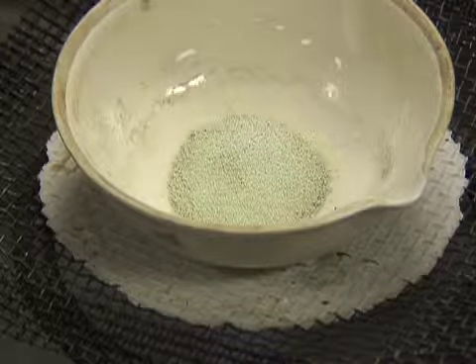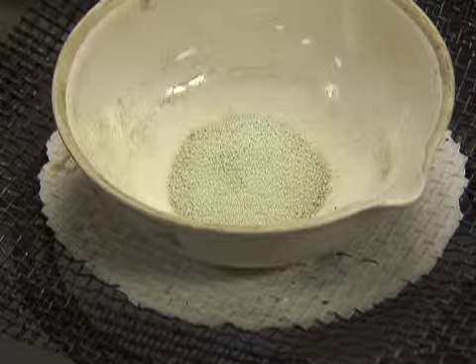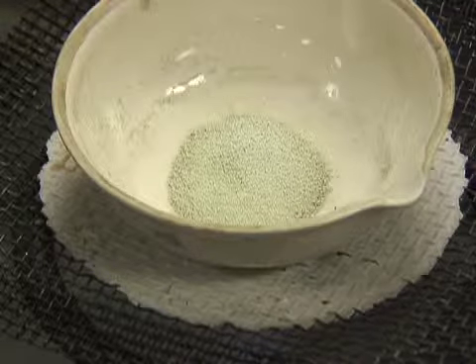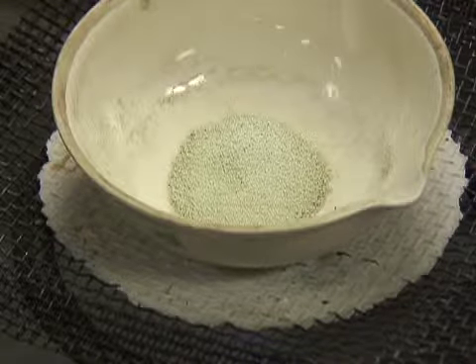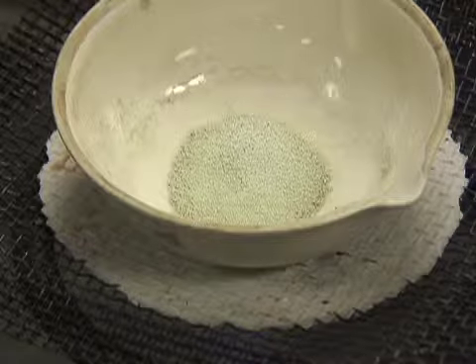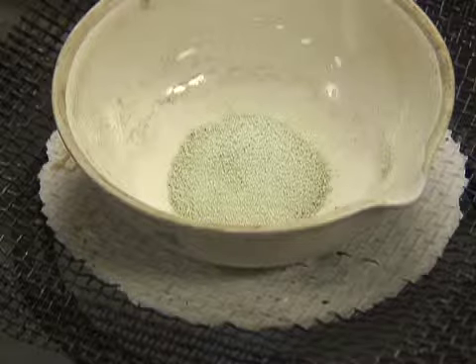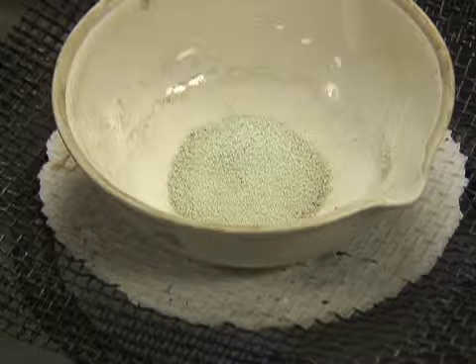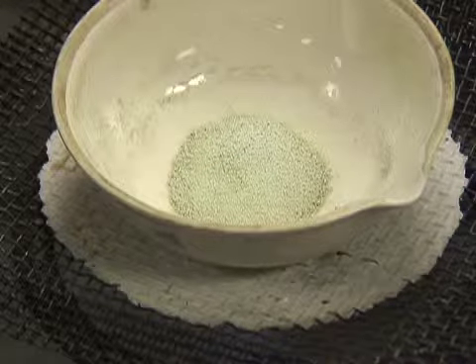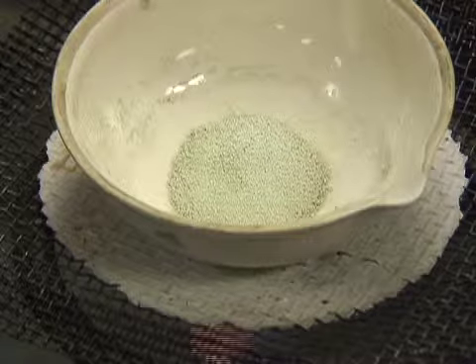While we are always monitoring the Bunsen burner, we can never walk away from it. If we have a partner, they could monitor it while we walk away, but somebody needs to always be watching the Bunsen burner. However, we could be working on our further investigations or our conclusions while we wait for this to heat up, because I always like to make the best use of my time. I might as well work on some problems now instead of waiting till later, when I have all kinds of other stuff to do.